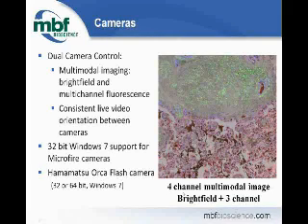This is especially handy if you've got a fluorescent label that is not ubiquitous and you need the resultant image data that can be provided by the bright field modality to get context for where the marker is actually being displayed. And so what this allows you to do seamlessly is create a bright field and 3-channel fluorescent image.